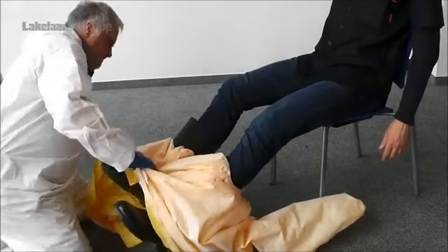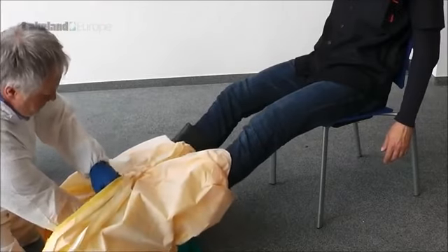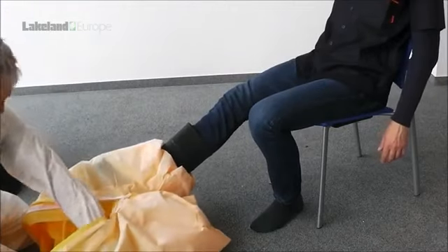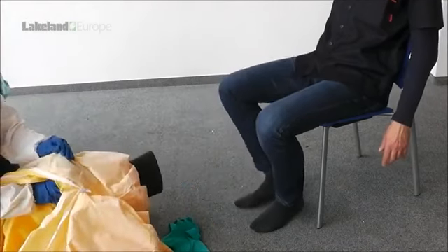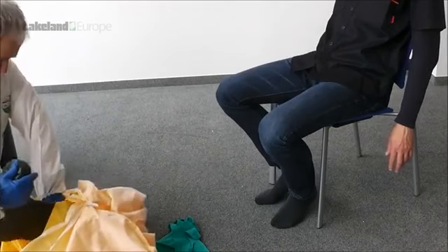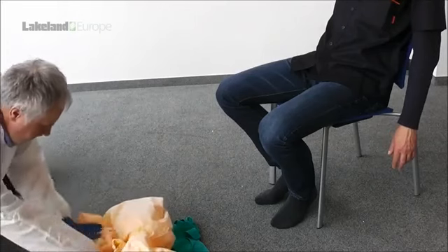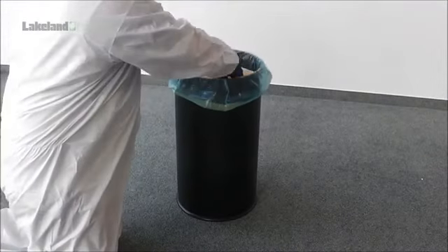It is important to stress that during the whole doffing process, it is vital that neither the wearer nor assistant touch any part of the other's body or clothing with any contaminated gloves. Place the boots to one side for further decontamination if they are to be used again. The removed coverall, rolled up with the contamination inside, should be placed along with the gloves in a suitable bag for disposal.